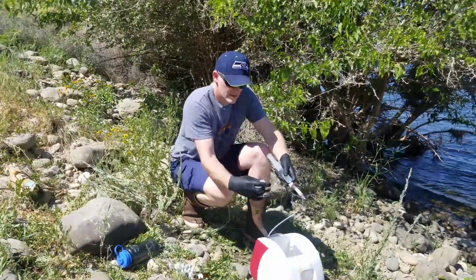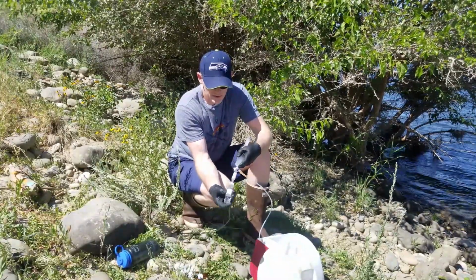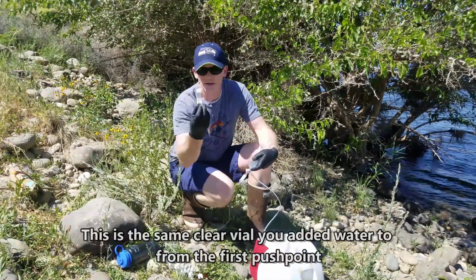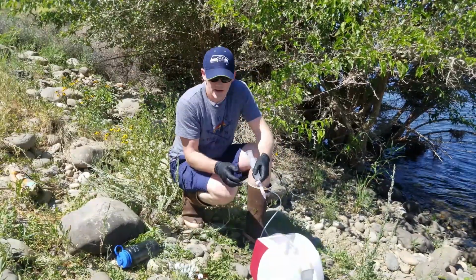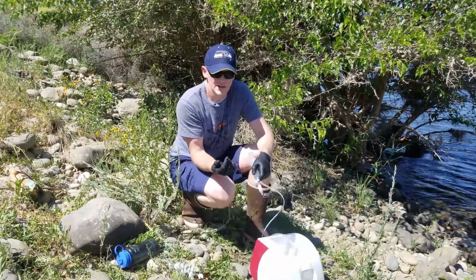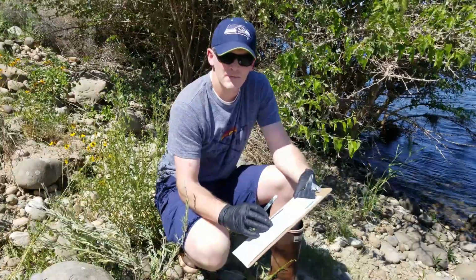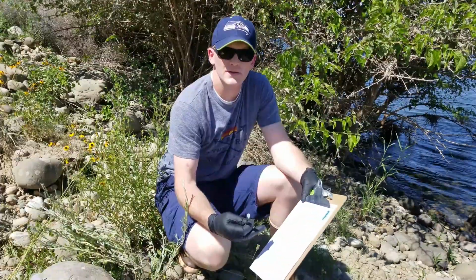Now, as I mentioned, we want to get a composite sample into this clear vial. So, next thing we're going to do is put a few more mils into the clear vial. We don't want to get to halfway yet. We want to leave some space for that third push point to fill it up to halfway. And then you're on to the next amber vial, halfway full. Make sure you invert it three times to mix in the acid, and repeat the process to finish off the third push point. After you finish sampling a given point in time, make sure your metadata sheet's completely filled out, and then repeat the process every three hours.